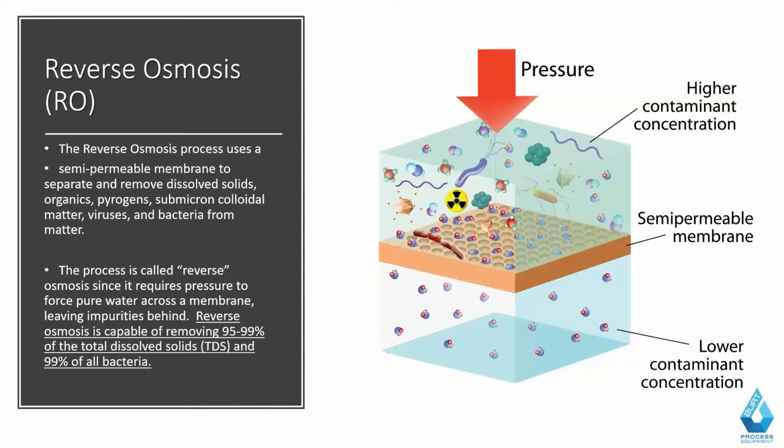We call out the RO in particular because it's one of the things that's heavily designed in your system and also has a reject source, something you need to take care of from a building standpoint. When operating an RO system, you have a reject, which needs to be collected and then reused as part of a reclamation system, which is the case in this LEED Gold building, or sent down for waste treatment, even though it's little more than concentrated city water at that point.